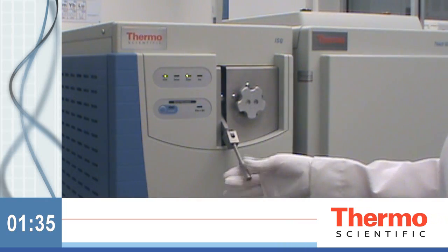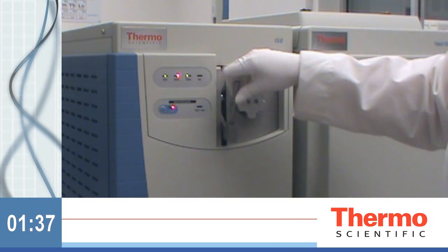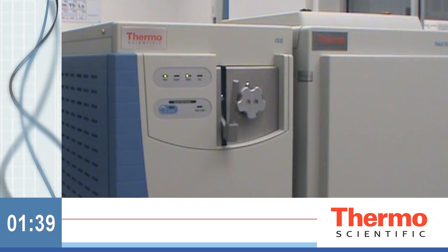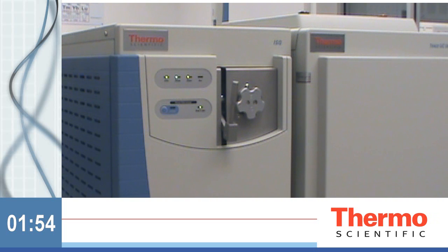Just think, a process that has always taken hours to perform and required you to vent and disassemble your GCMS system now only takes seconds. Regain lost time and redefine GCMS uptime. Rethink the way you look at GCMS productivity. Stop venting with the revolutionary ThermoScientific ISQ GCMS system.